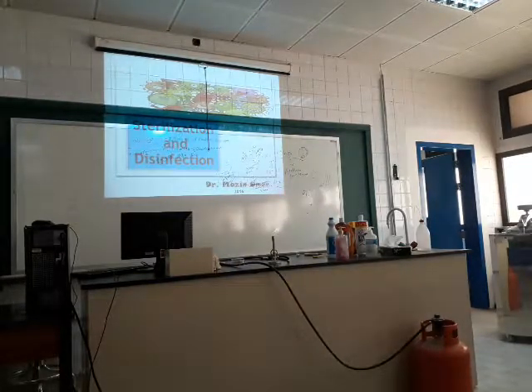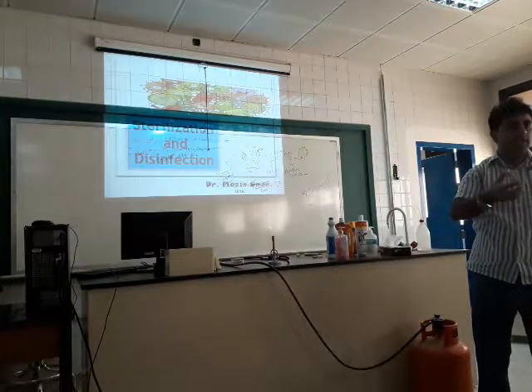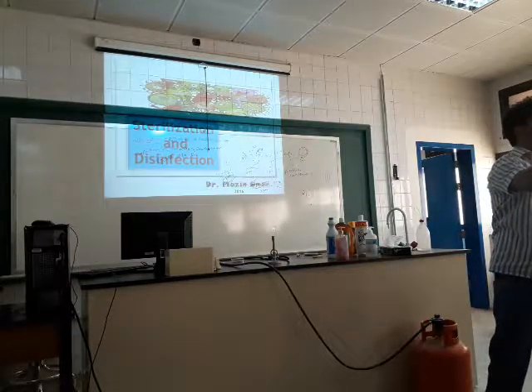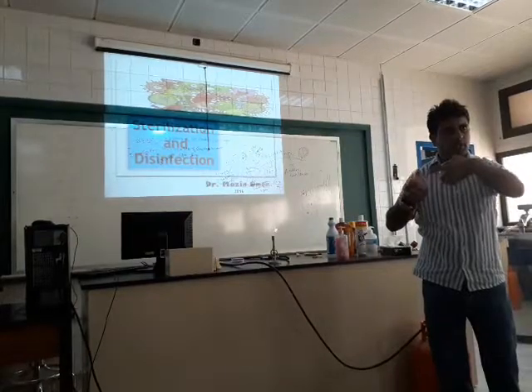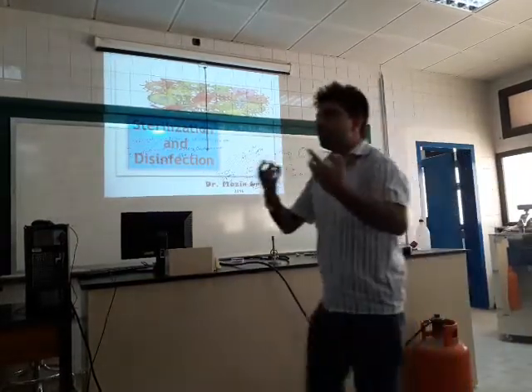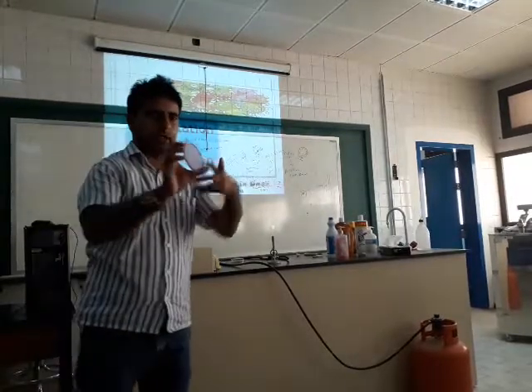I fix the temperature at 37 degrees, and if I put this inside for 18 to 20 hours, next morning you will see bacterial growth here. This is the culture plate, and inside is the media, the food, like we eat for growth and development, right? Similarly, bacteria eat from here.